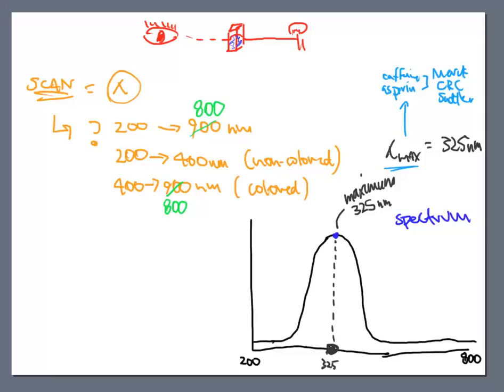So this will save me some time, right? If I know I'm analyzing aspirin, I can go to a textbook like that one, open it up, find aspirin, read it, find the Lambda Max, and it will tell me the number that I should be analyzing for the solution. Sometimes the laboratory experiments will tell me as well. So if I'm looking at a research article or a lab experiment that I'm given or a laboratory practical, a lot of times they want to save you the trouble of the scanning, and they just tell you the number that you should be analyzing at. And then that way you can just go to that number and skip the scanning and save some time, save some energy, and get things done a little quicker.